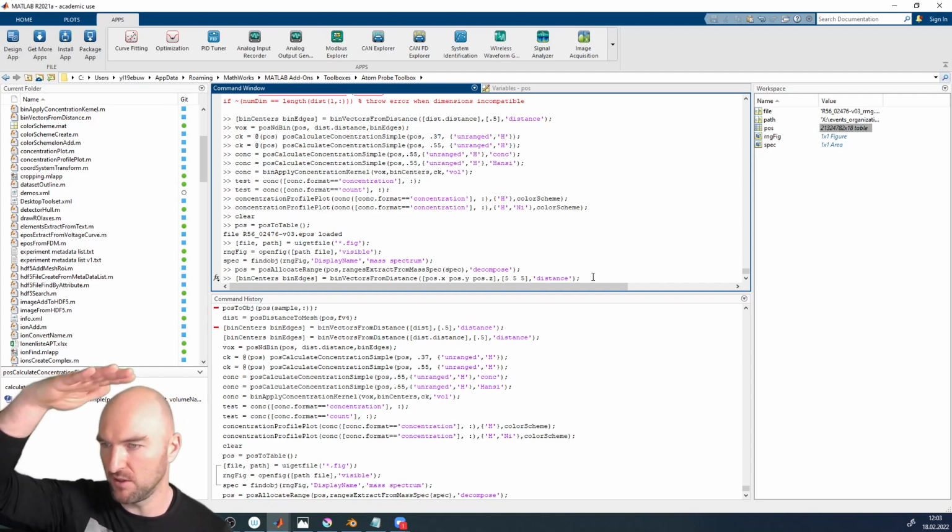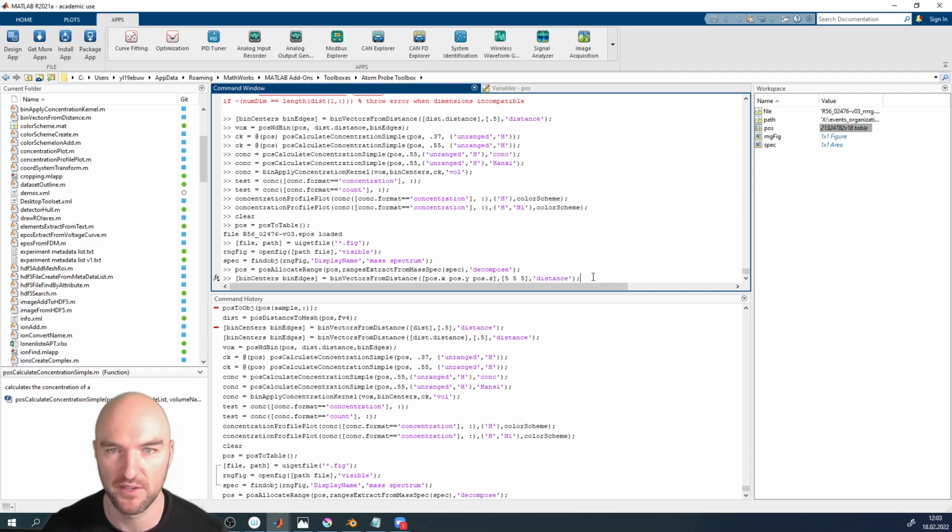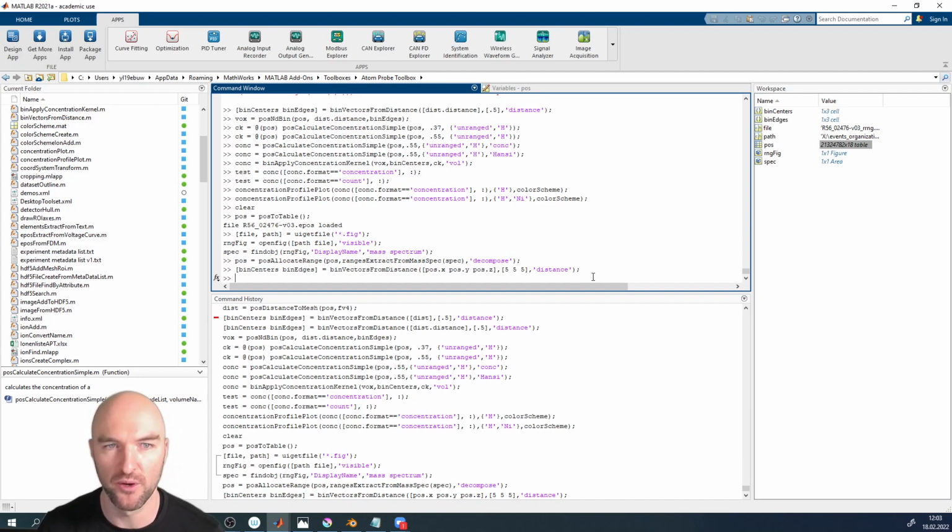And sometimes, maybe you want to do field evaporation map stacks, stuff like that. Then you have very anisotropic voxels. Okay, and you want to do that by distance, of course, because we're three-dimensional, and it doesn't make much sense to go by count in 3 dimensions, because otherwise the voxels wouldn't fit together. That really only works in 1 dimension. Okay, so we've got the bin centers and the bin edges, and now we are calculating the voxelization, in this case in 3 dimensions.